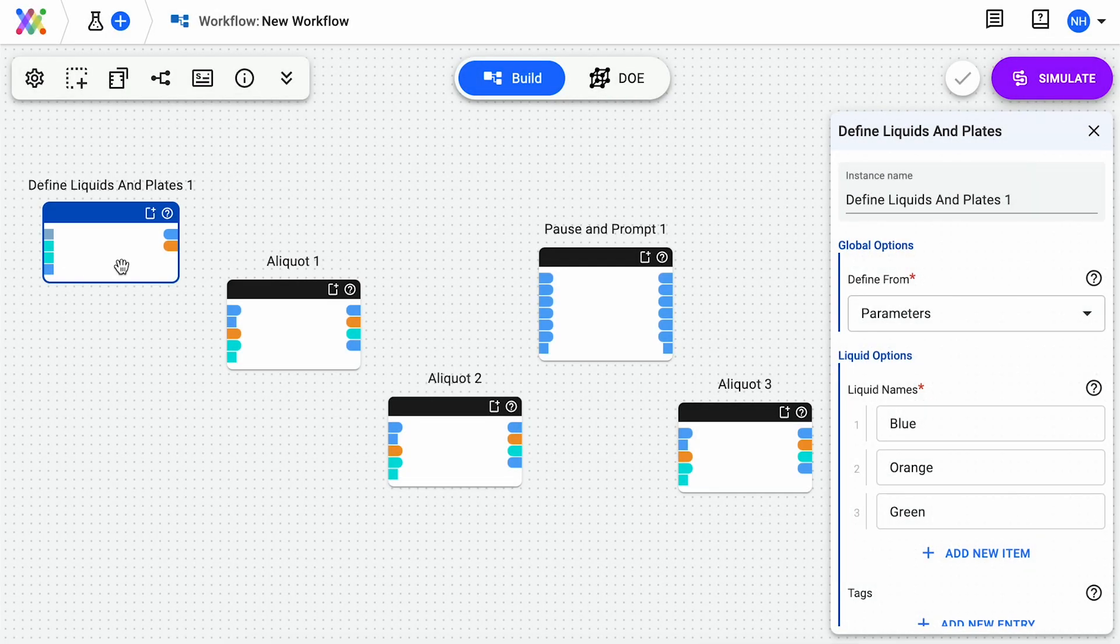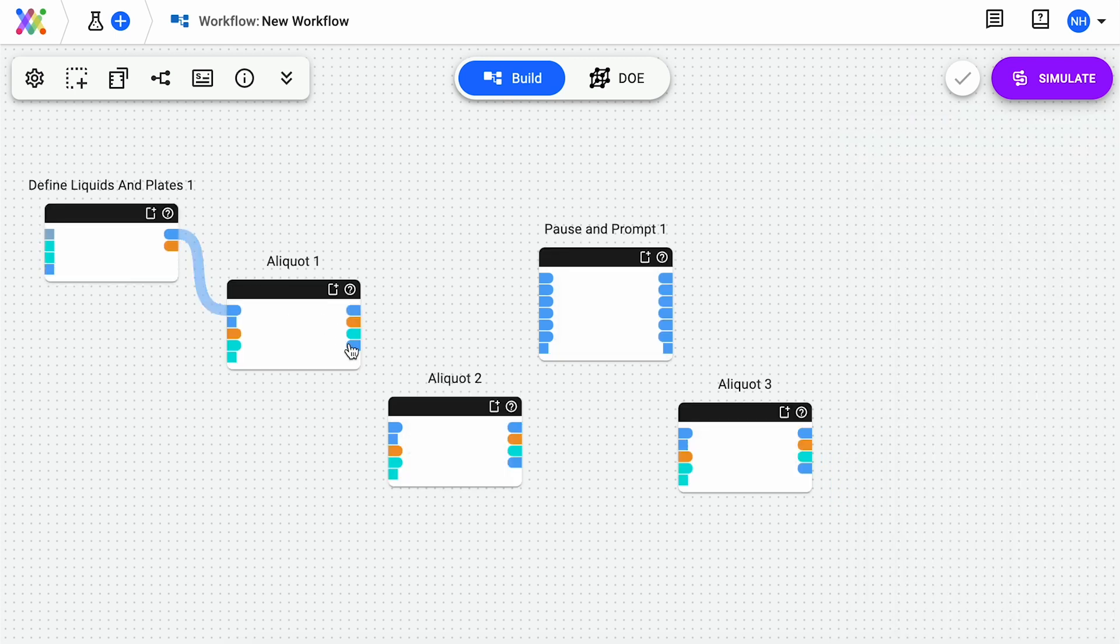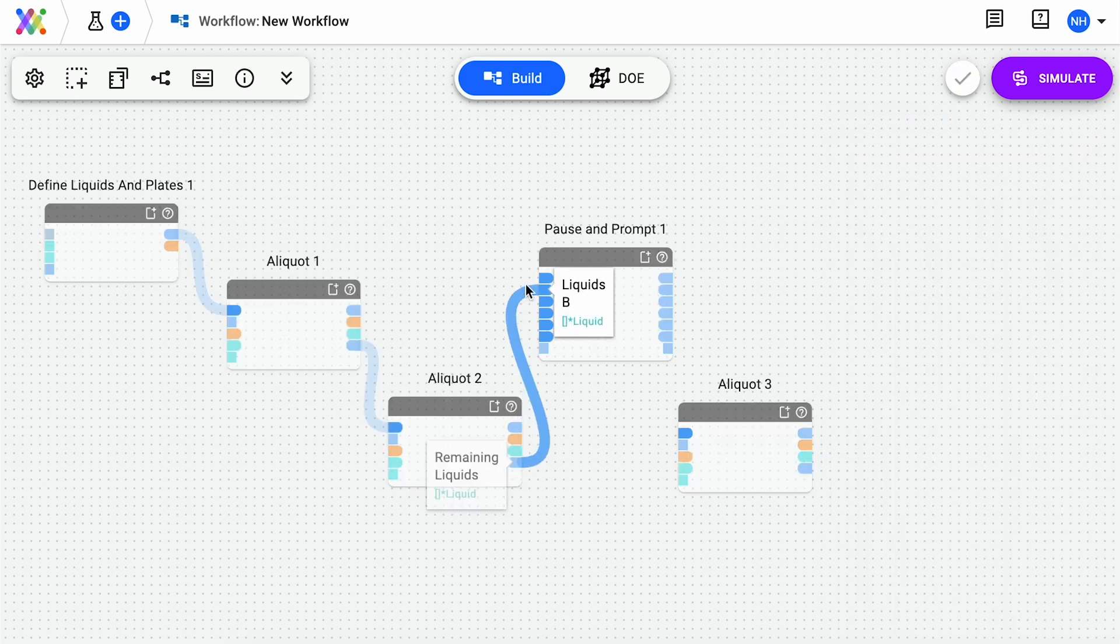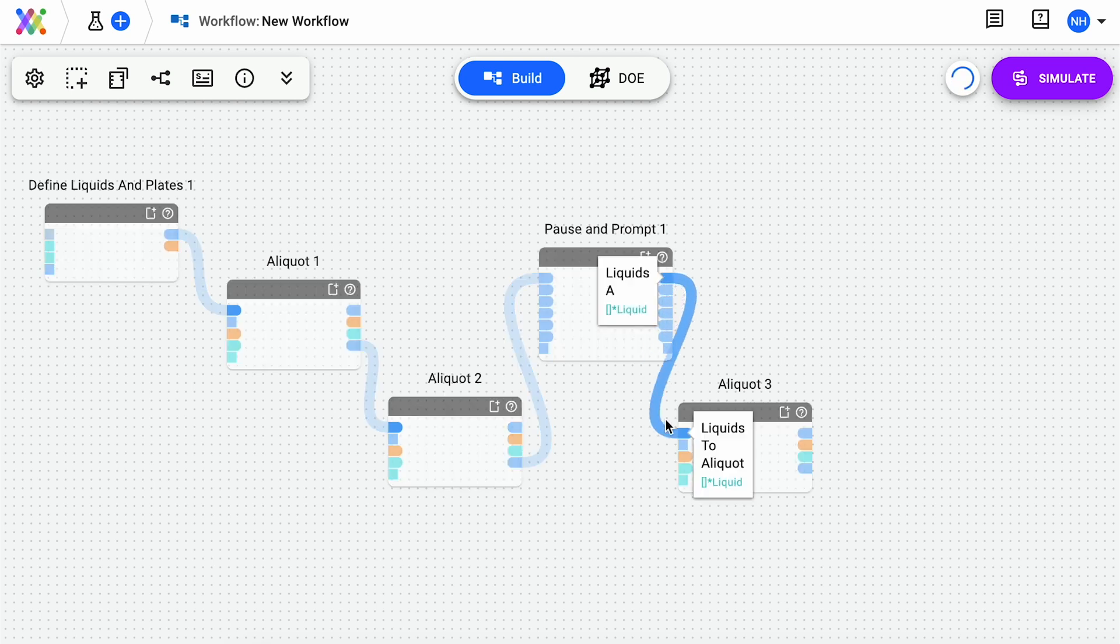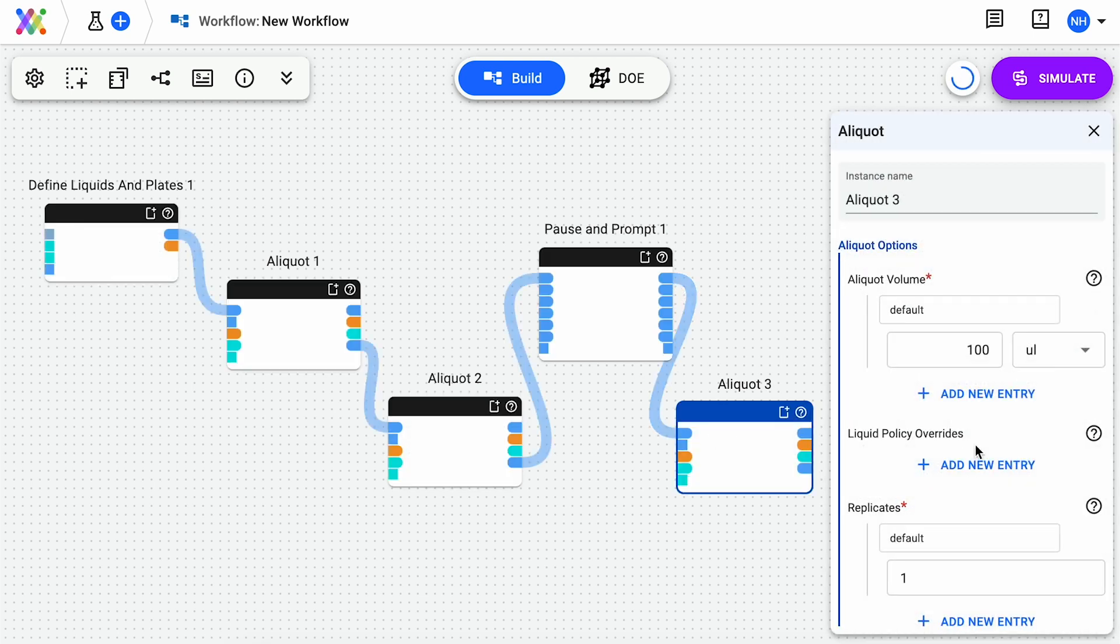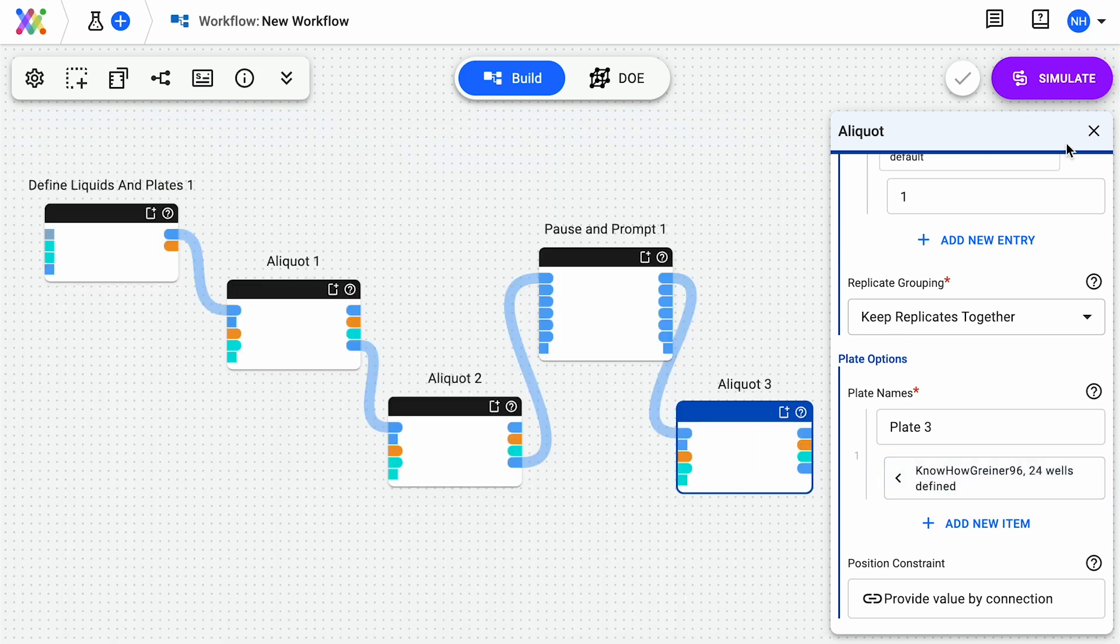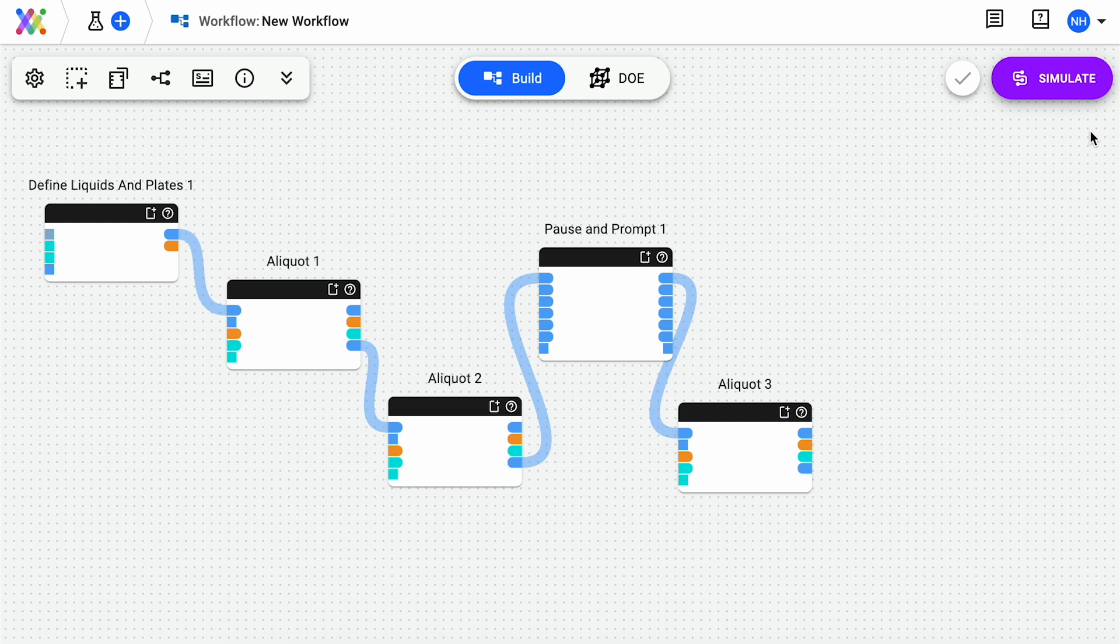You can either define your plates in a single aliquot element, or define each plate in a separate aliquot element, as shown here. The order of aliquot elements on your workflow builder, or the order of plates defined in your single aliquot element, will determine the order in which the plates are dispensed onto by the Tempest.